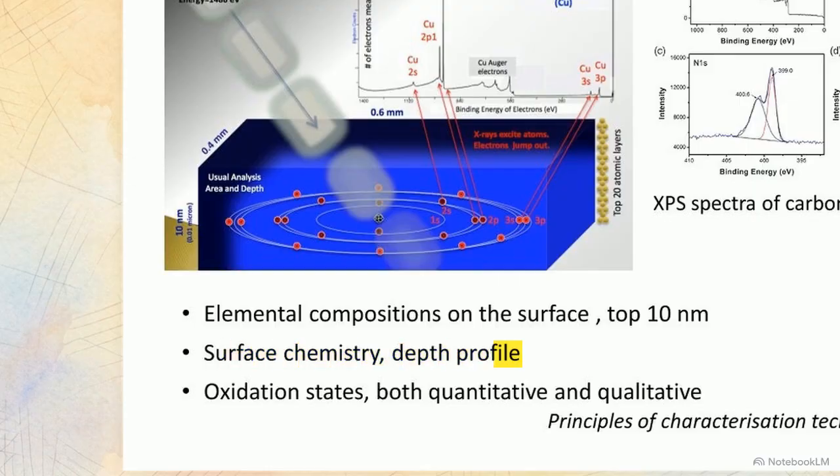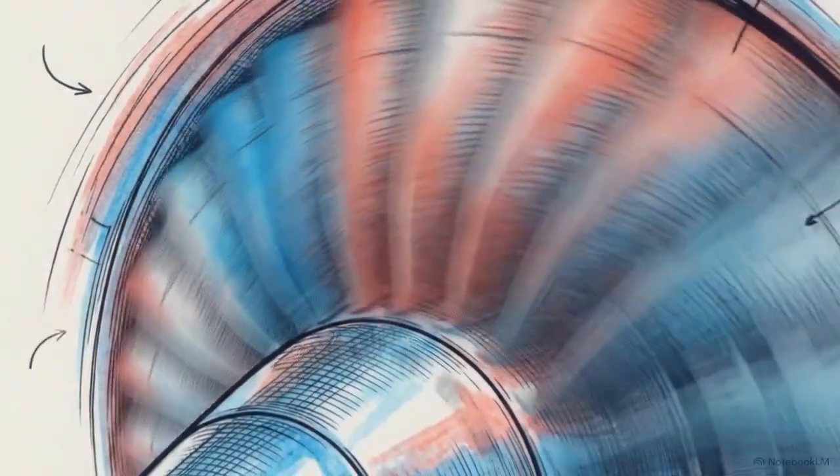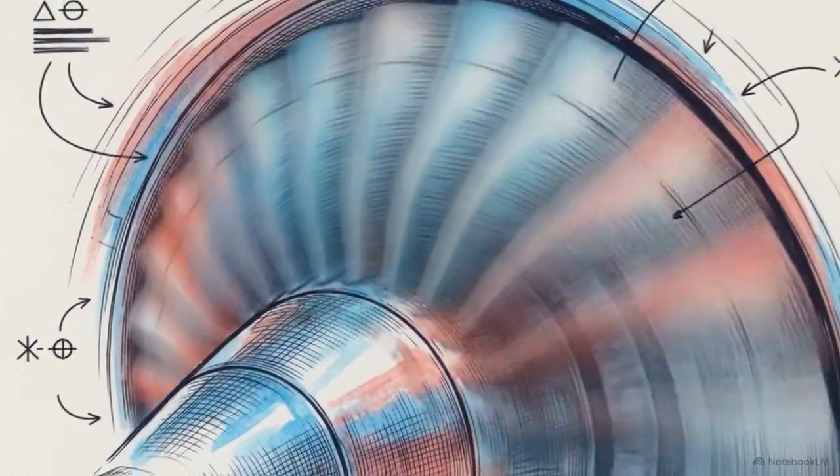By controlling the generation of X-rays and carefully analyzing the precise peaks they produce, material scientists can reverse engineer these invisible atomic behaviors into the hard, macroscopic data required to drive modern engineering.